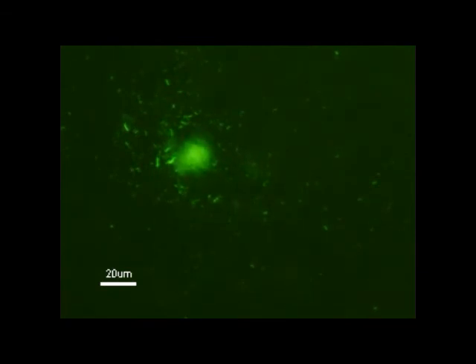Look how far away the bacteria are now from the lysed amoeba cell. That shows how rapidly and aggressively the Legionella bacteria move away from the host after it lyses.